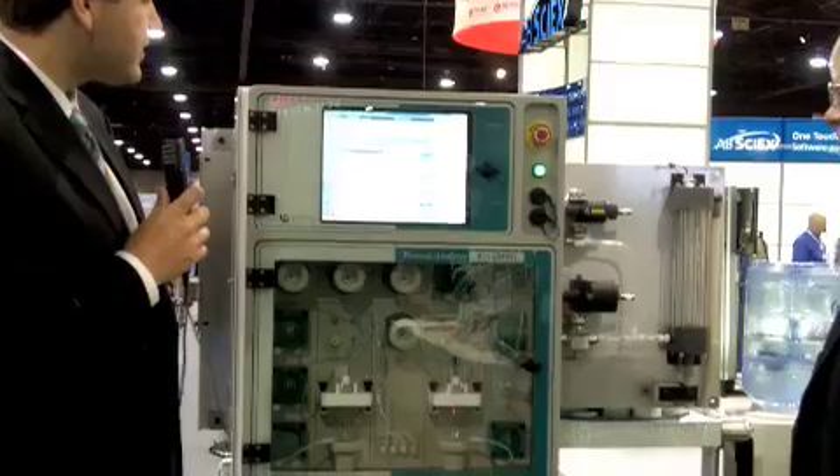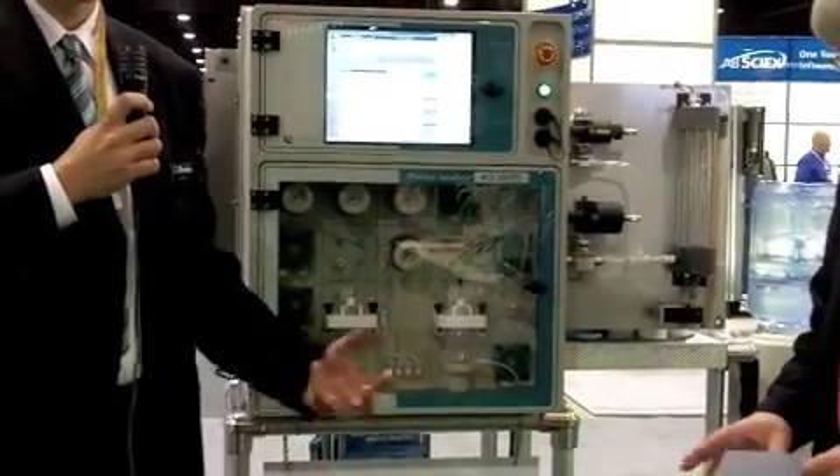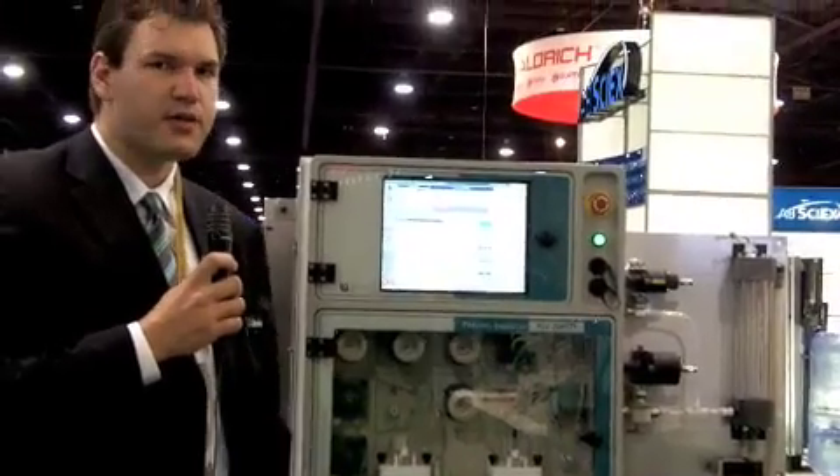My name is Nils Gell, Product Manager for Process Analysis with Metrom USA. The new Process Analyzer, ADI 2045 Ti, is located in the process and performs process analytics for all kinds of different applications. It is based on analytical methods and techniques which we already use in the laboratory, and we can easily adapt the process analyzer to use those same techniques and methods in the process.